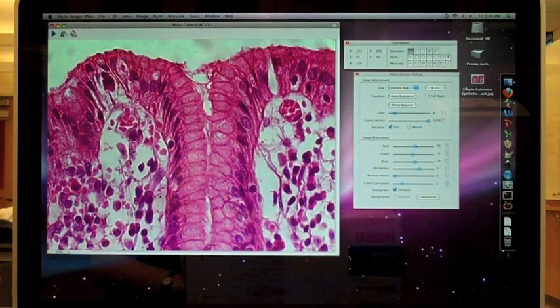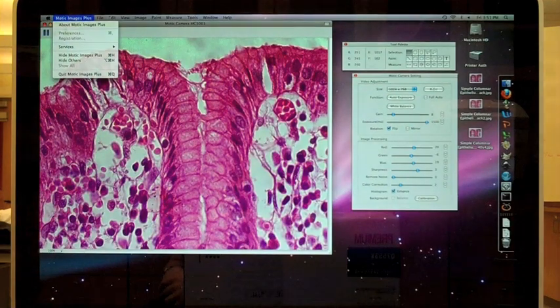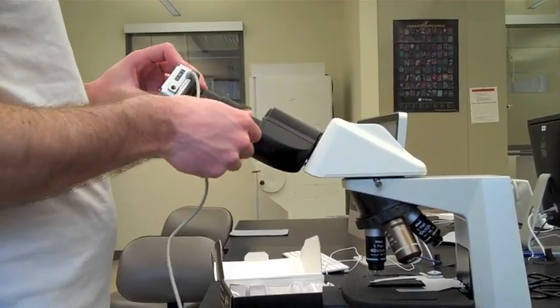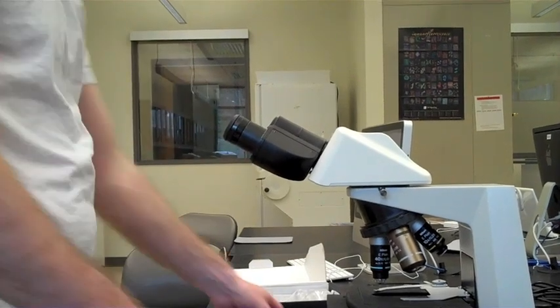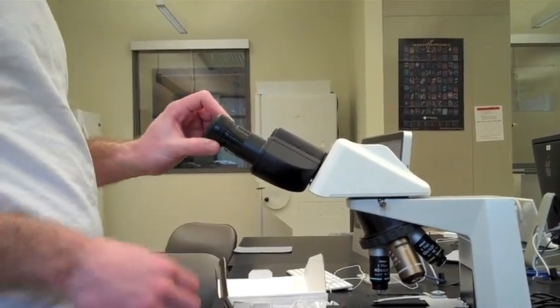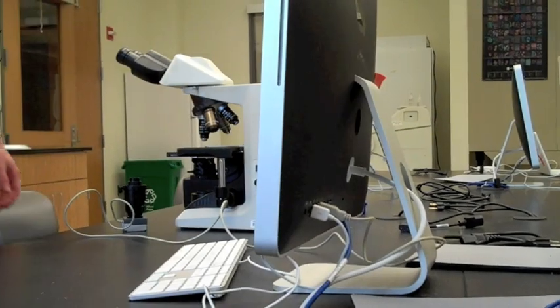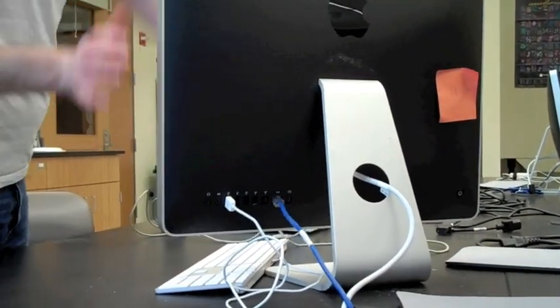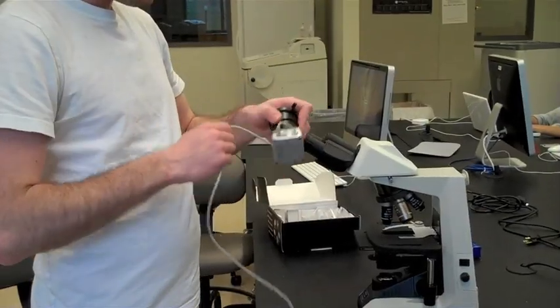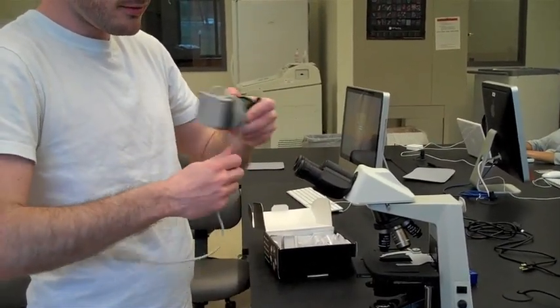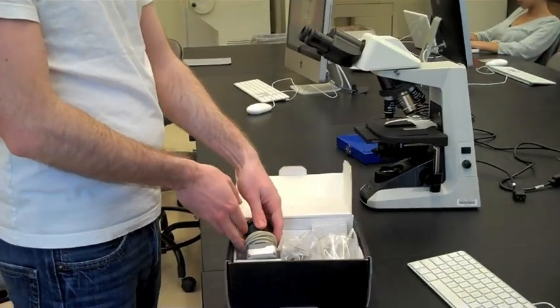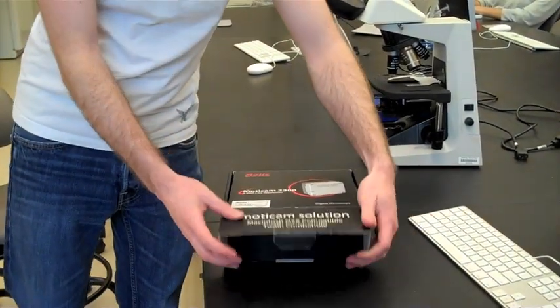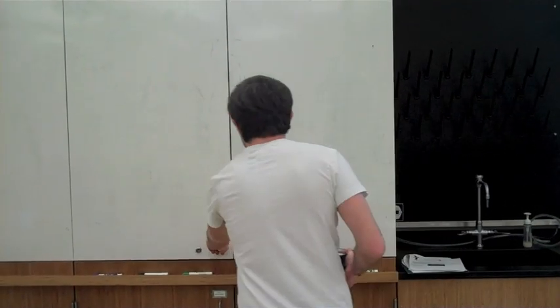Your image is now saved so you can quit out of the Motic Images Plus software. Unscrew the Motic camera from the microscope and replace the ocular lens. Remove the USB cable from the back of the computer. Wrap the camera in its USB cable and place it in the box. Close the box. Put the box back in the cabinet.